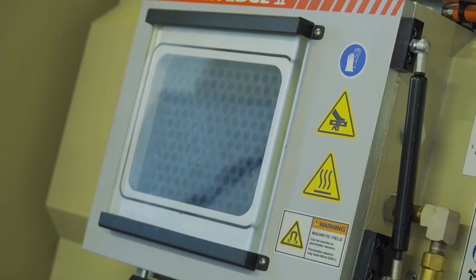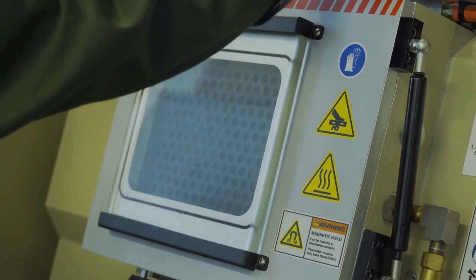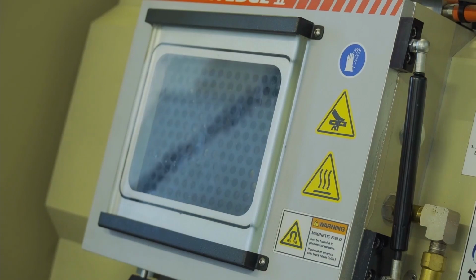So now we want to remove the sample. And to do that, the first thing we want to do is tank vent. So what you are trying to do is to release the vacuum in the chamber. When you press tank vent, the vacuum pump does that automatically. But to speed this up, I'll just open this. So we're releasing the vacuum.